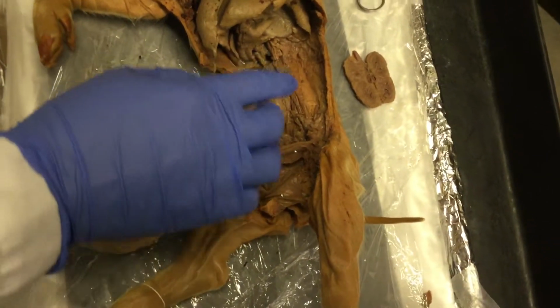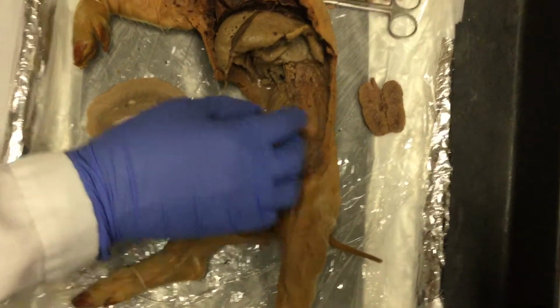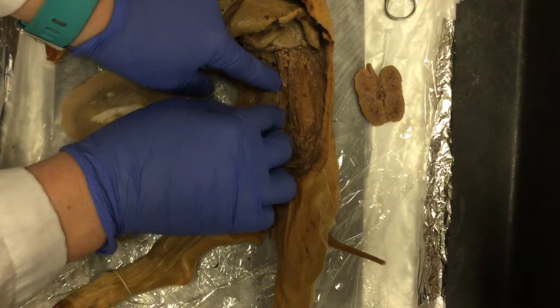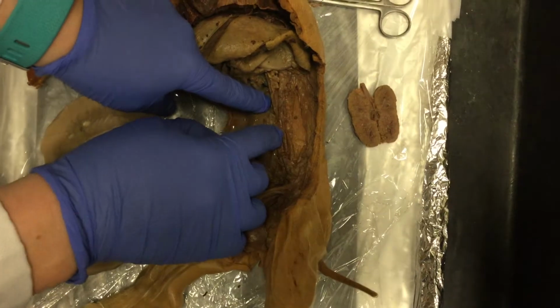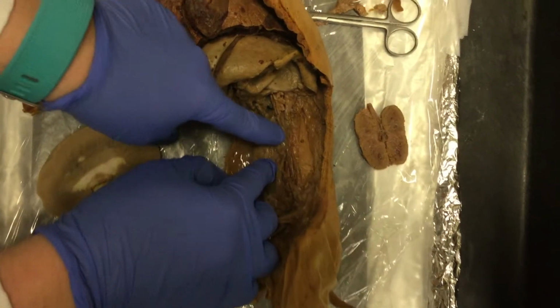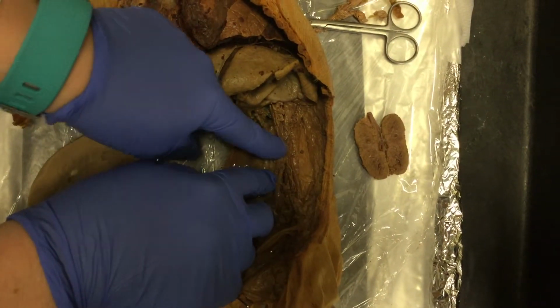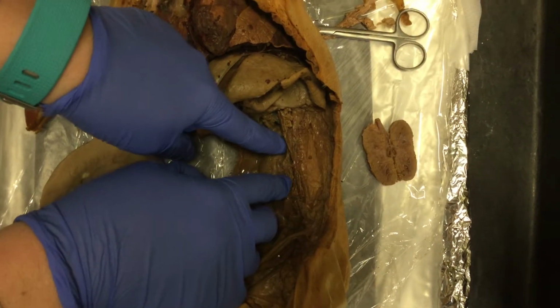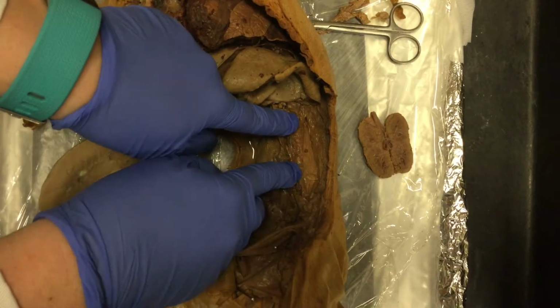The structures that we can see here, we have the renal vein and renal arteries, usually connected right here in this area. It was really hard for me to find those structures though. I don't know if the pig was too small, but I couldn't really find the renal arteries and renal veins when they were connected. I was able to find them better once I disconnected the kidneys from here.